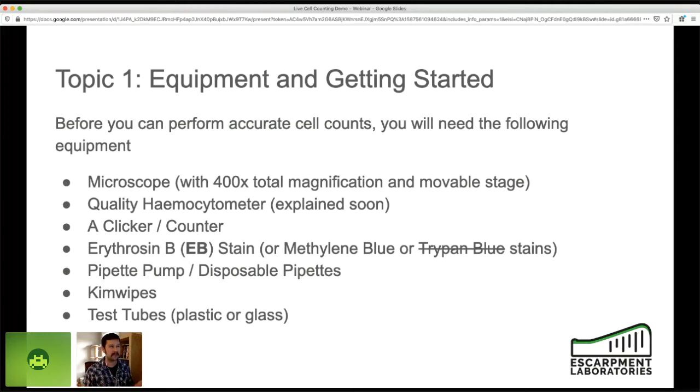I think they're like 5 to 10 cents each, but that's per sample, and you have to buy quite a large amount of them at once. So depending on how often you're doing your counts, using disposable equipment like that is probably the best thing. But if you're doing counts less frequently, like let's say you're at a homebrew level, maybe going with glass is something you'd want to consider. Just keep in mind that glass can break, so it's something to be aware of.